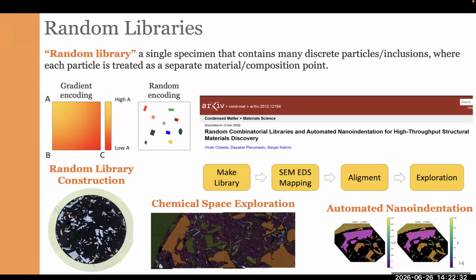And obviously, such exploration can be run with a standard optimization loop, such as Bayesian optimization. You may try to find some optimal functionality, or you can just run your Bayesian optimization across the compositional space with an exploration acquisition function.